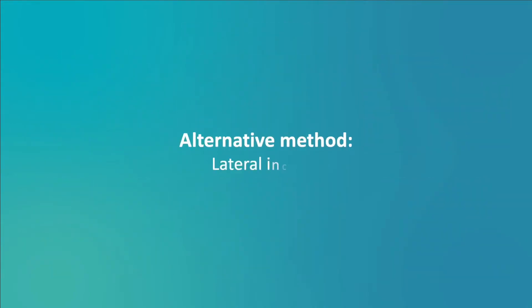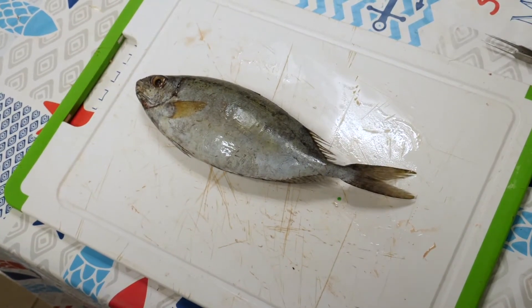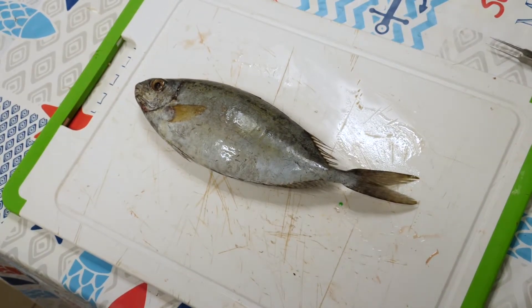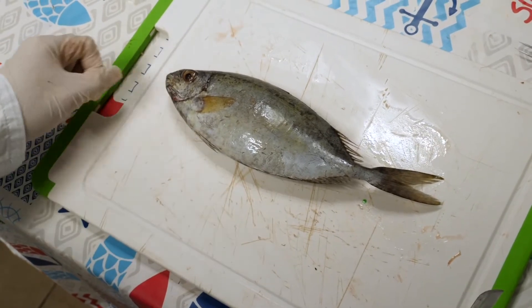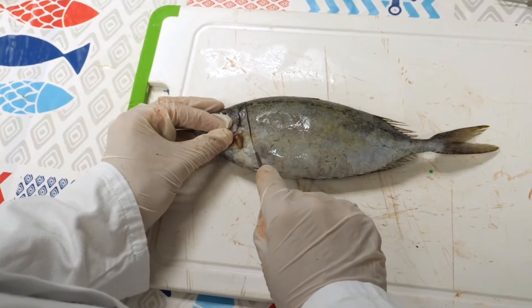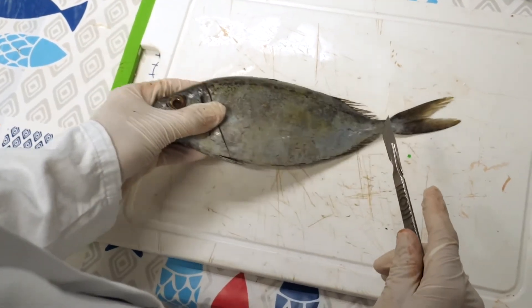Alternative method: lateral incision. A second method is used for herbivorous fish, particularly the Acanthuridae family, such as the unicorn fish, and the Siganidae, such as the rabbit fish. The principle of this method is to use a scalpel to make a lateral incision from the gills to the anus on both sides of the fish. As you get close to the abdomen, the incision must be increasingly shallow so as not to damage the internal organs. Do the same thing on the other side.